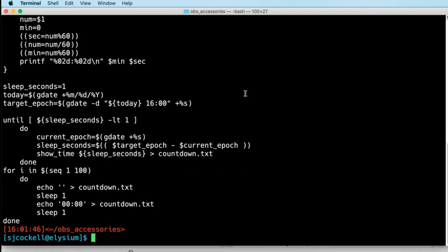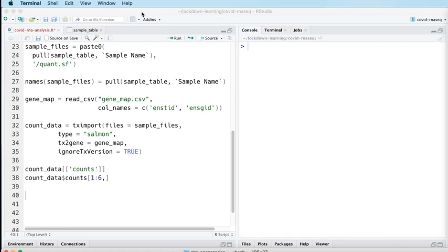I think that was quite a nice little exercise for myself to be able to do last night. So I thought I'd share that with you before we get going. A little bit of practical Bash.